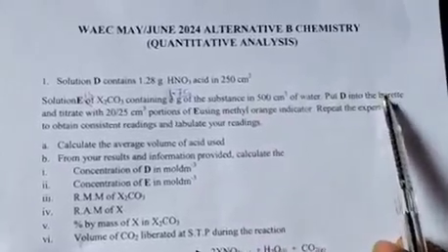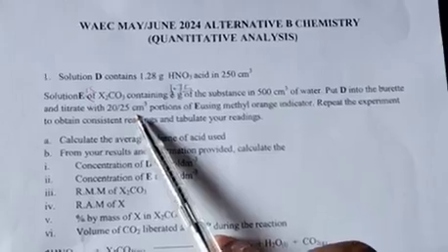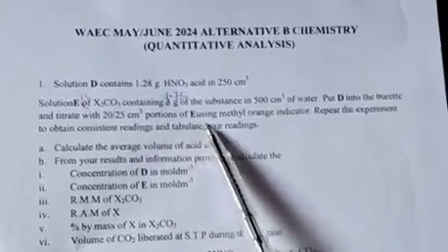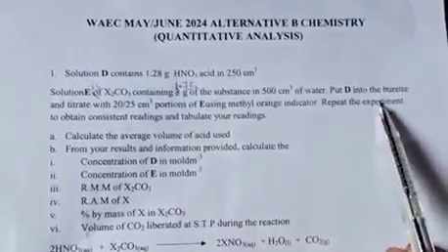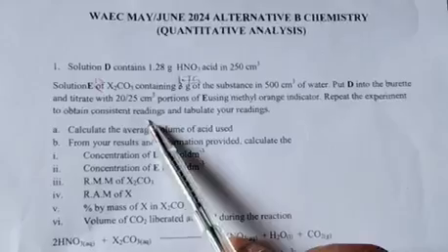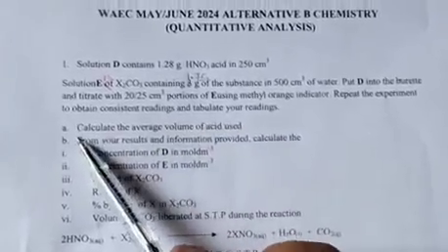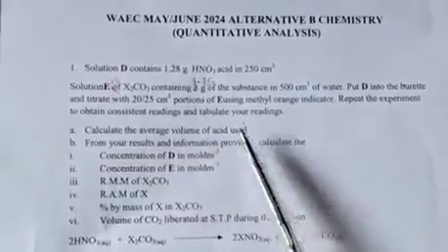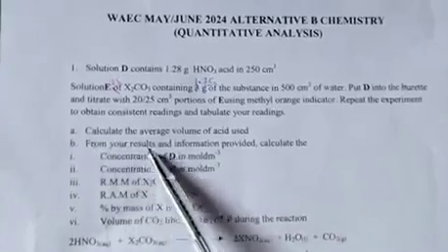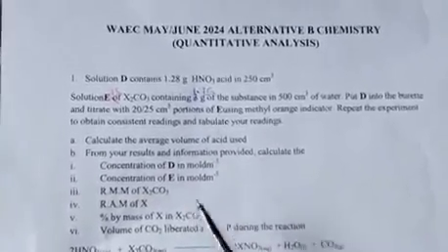Put D into the burette and titrate with 20 or 25 cm³ portions of E using methyl orange indicator. Repeat the experiment to obtain consistent readings and tabulate readings. And they will have calculations. A, calculate the average volume of acid, that is of D used. Then B, we have other calculations which we're going to do after the experiment. So let's go to the experiment now.